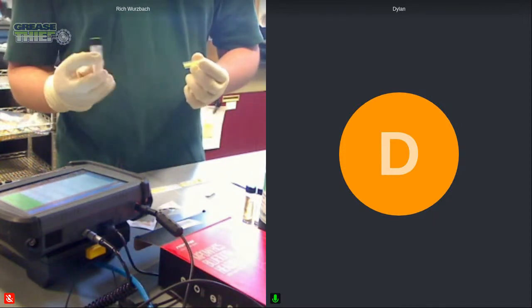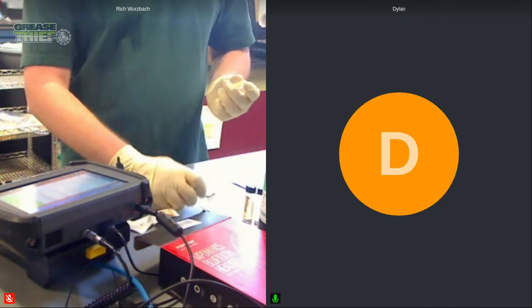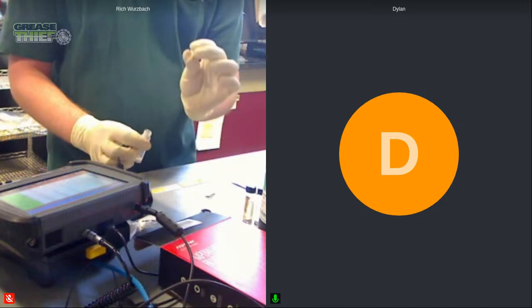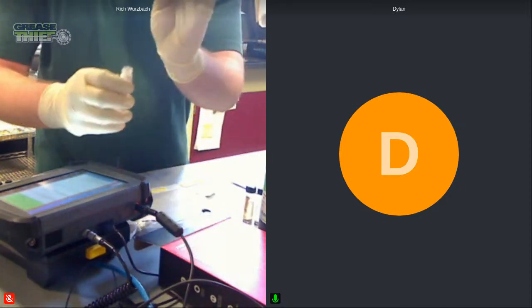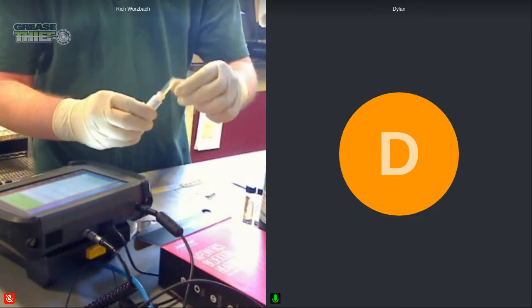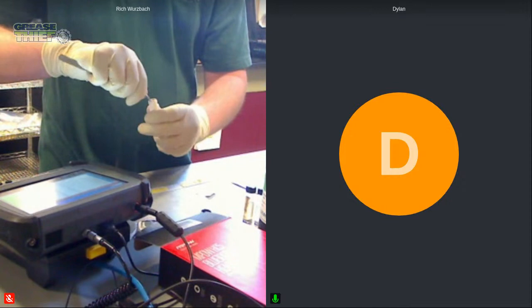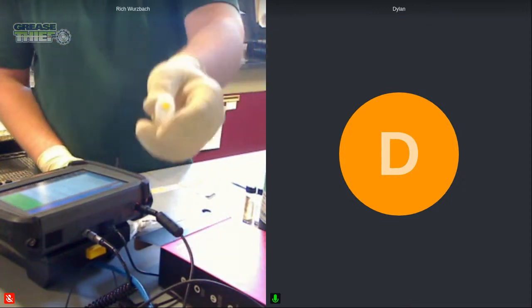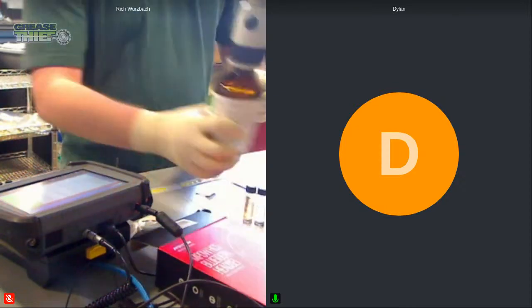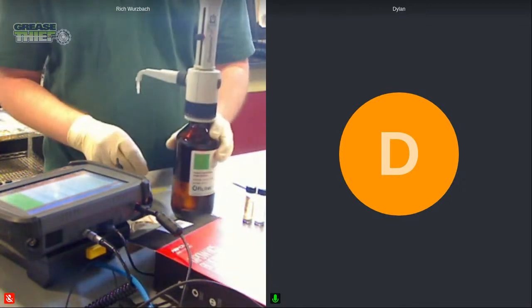So here I have a ruler vial that you can see. I put a green sticker on it, so we're going to know that it's green solution. So I'm going to open it up like this. I'm going to fold the grease substrate like this, nice and tight, if we can see it there. And then we're going to put it in the vial. And we saw a picture of this in the slides very briefly. So I'm going to slide it in there and use my tweezers to help me. And I'm going to get it so that it's kind of sitting along the side like that. It's not interfering with anything. And then we have our ruler solution here, which has a nice green square on it. And we know that it's the ruler green solution.